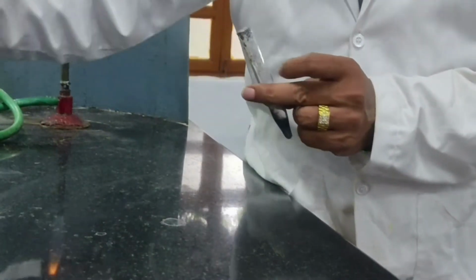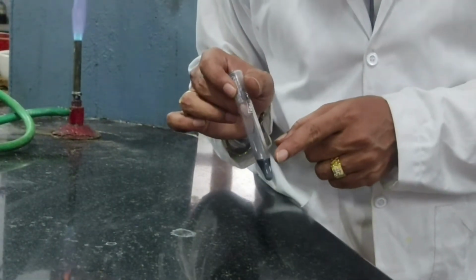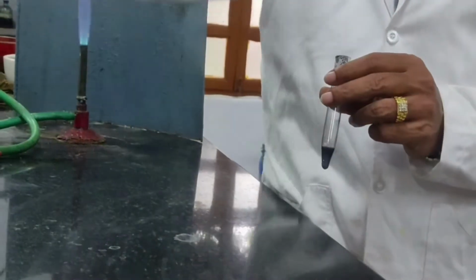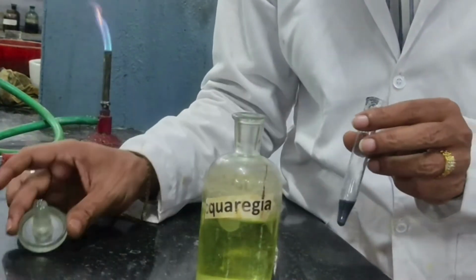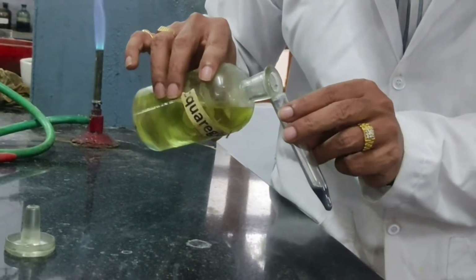Now to this residue, I must add a few drops of aqua regia. So this is aqua regia. I am adding a few drops of aqua regia to the residue.